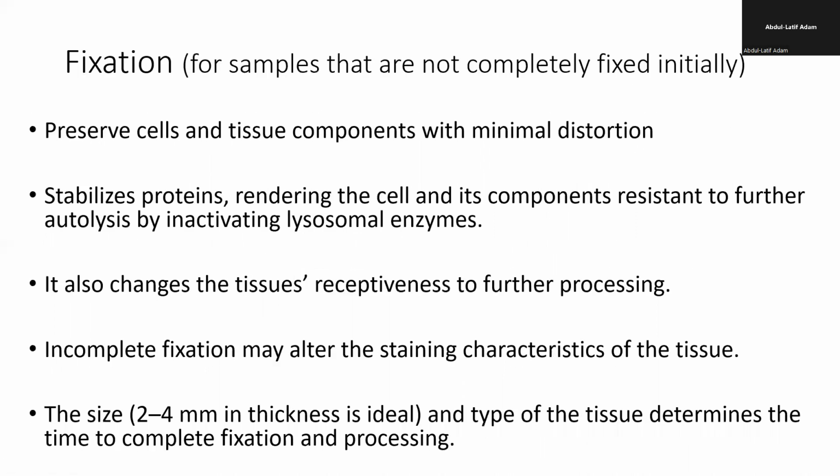Let's talk a little into details about fixation. Fixation is the process by which the tissue cells are preserved from distortion. I mentioned to you that if, let's say, I will use fish because fish is similar to meat, if you have meat and you don't freeze the meat and you leave it on the bench, what do you think happens to the meat?